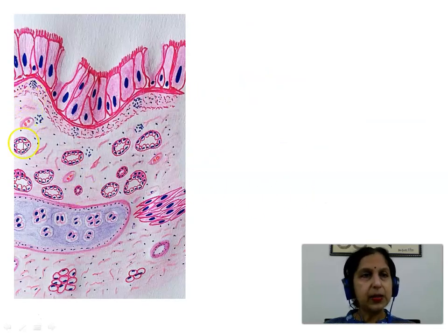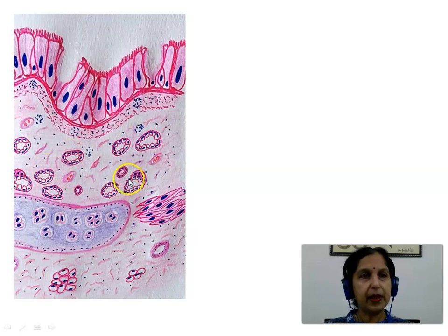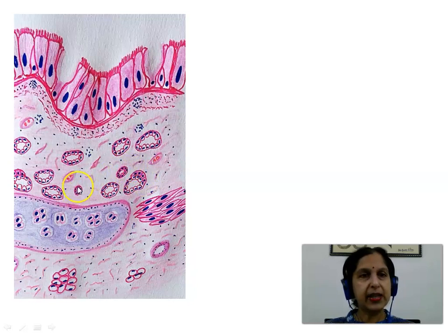Here we see the submucosa showing mucous acini as well as mucous acini with serous demilunes. We also see the ducts of these glands lined by simple cuboidal epithelium along with blood vessels and few lymphatic aggregations.